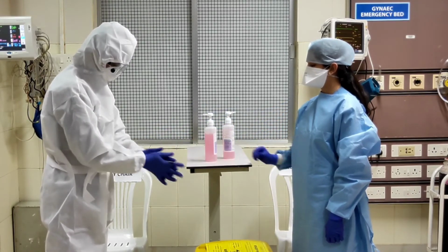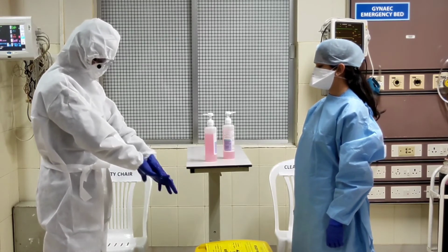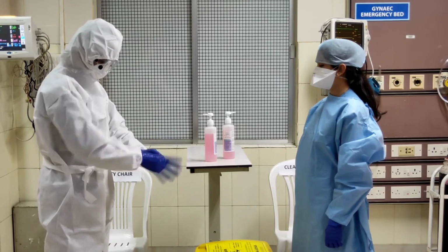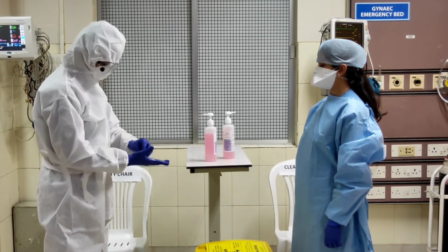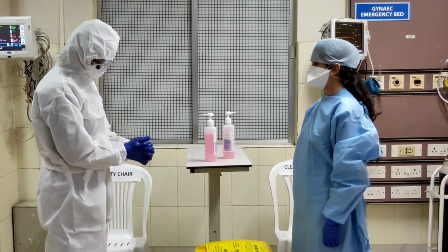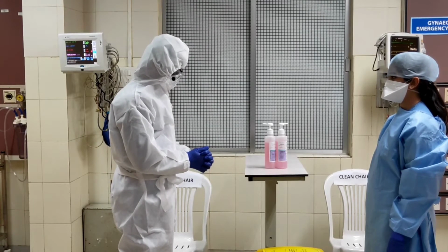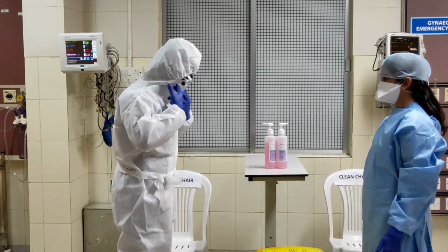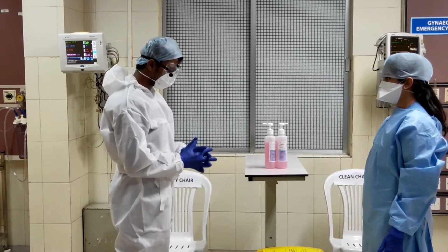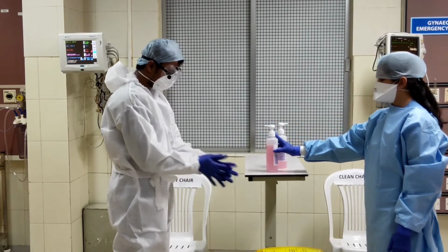With the hand sanitizer, properly do a hygienic hand wash. After disinfecting your inner gloves, you can pull back the hood of your PPE without touching the outer aspect of the PPE. Make sure the PPE hood is positioned back to your neck without touching it. Again, disinfect your inner gloves properly.